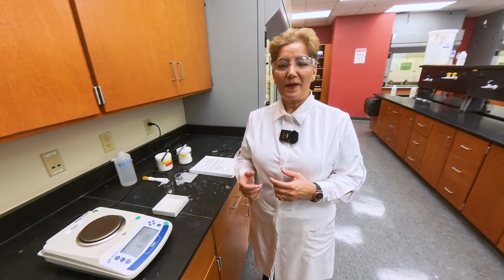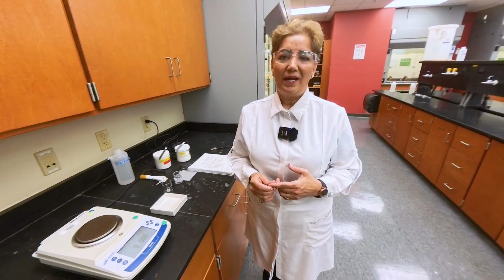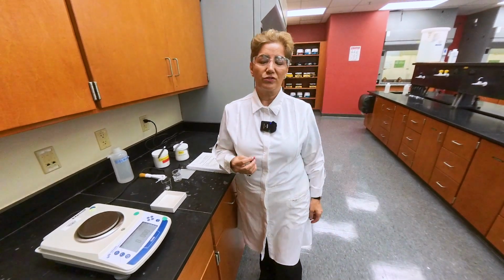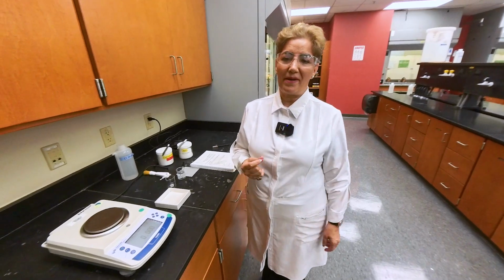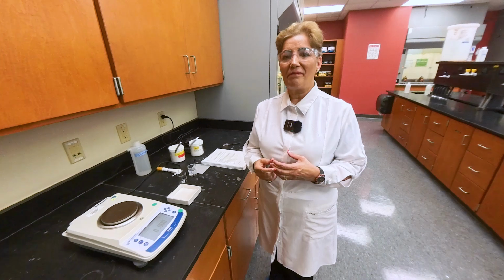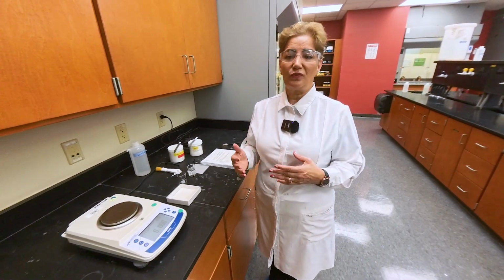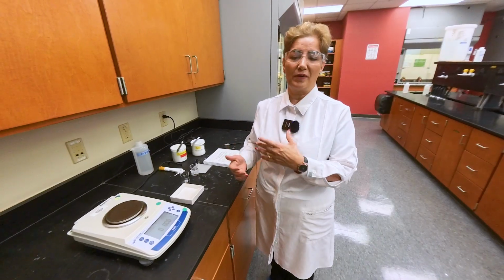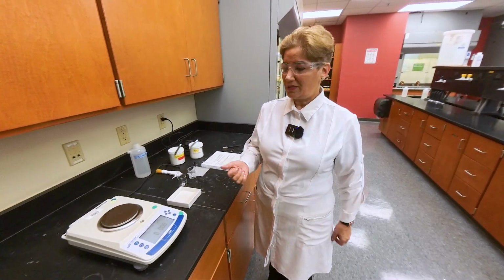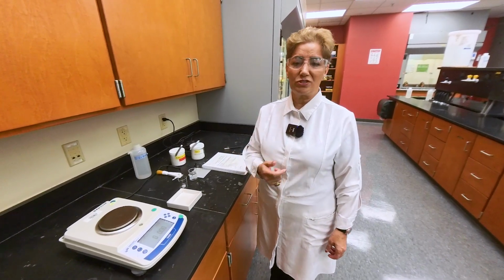About the experiment, you must have a lab manual for this experiment. And for all experiments, you do need the lab manual. So make sure that you are using the lab manual and reading the procedure from it, because without the lab manual, you're not going to be able to differentiate between different methods of a simple procedure like measuring mass.